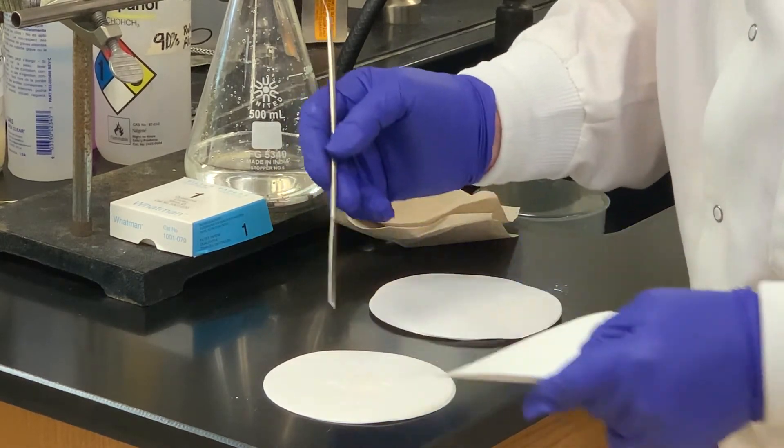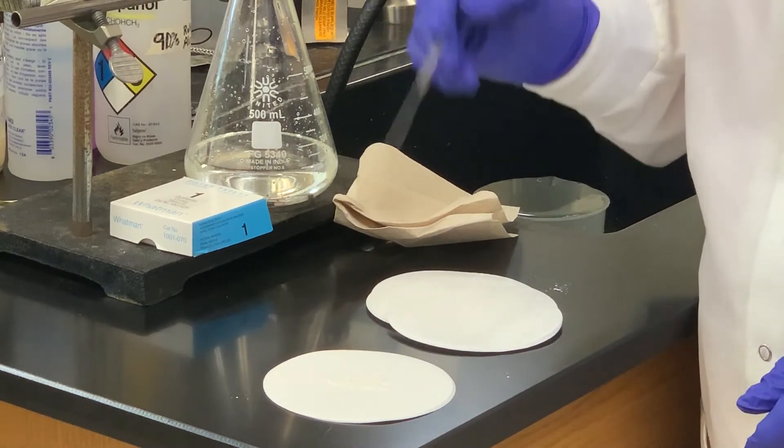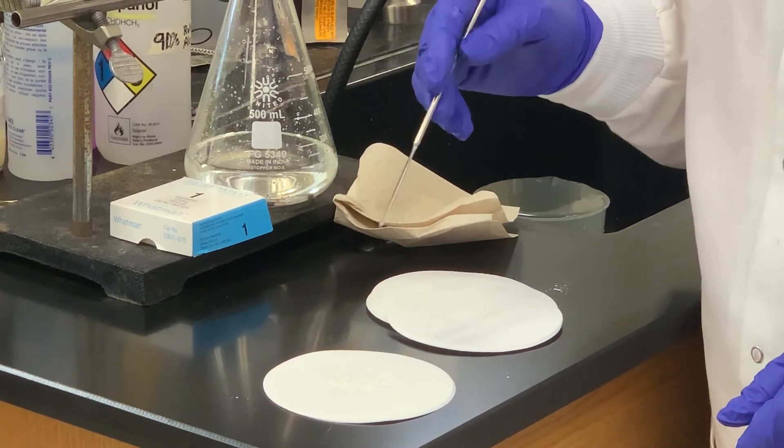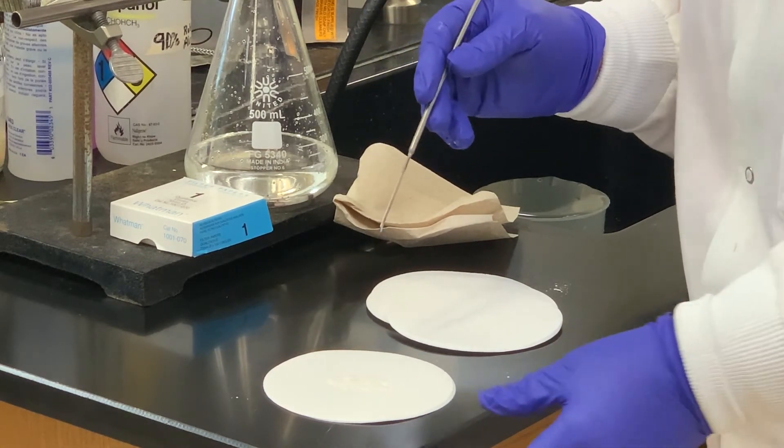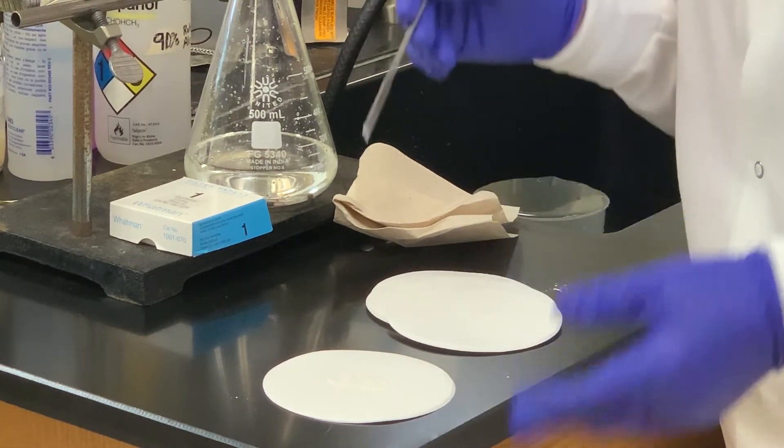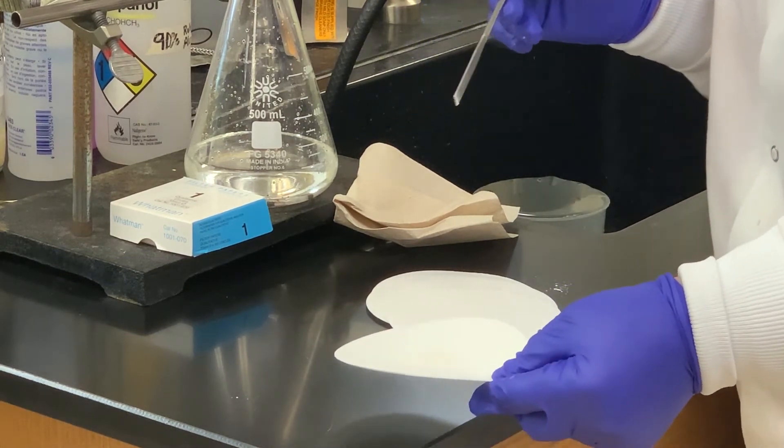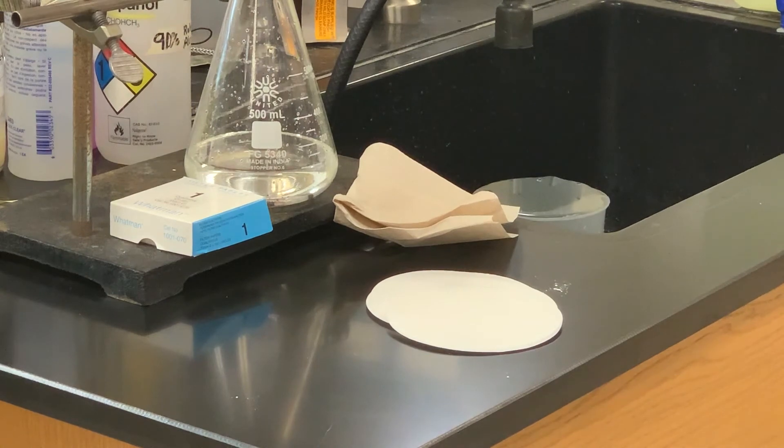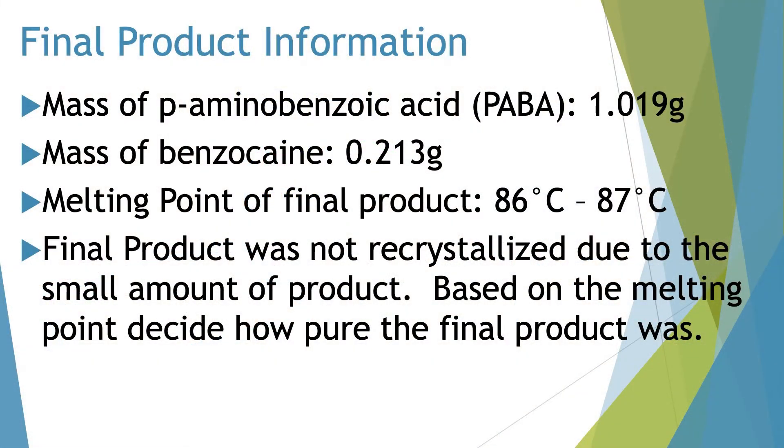I think that's pretty good. And what I'll do is I'll take this over to the balance, get a weight, and we'll do a melting point. And from there, you will record or calculate your theoretical yield and percent yield and match it up to how pure the product should be in terms of its melting point.